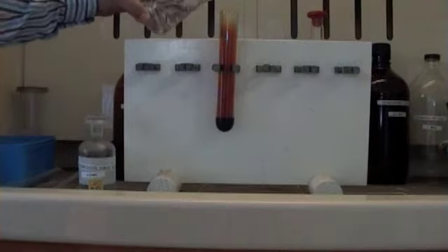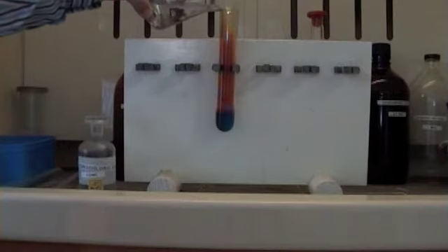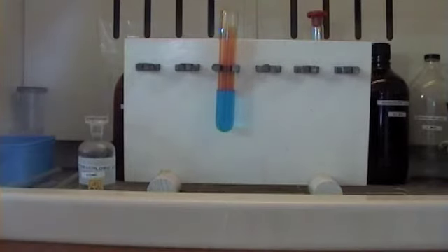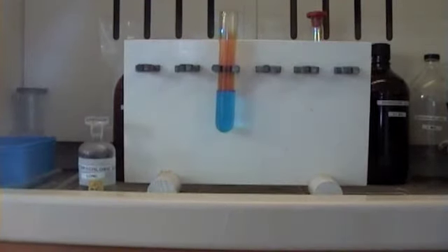So when I do this, we get that colour change to blue. Those are the hydrated copper ions. H2O. No, water, not that American stuff.